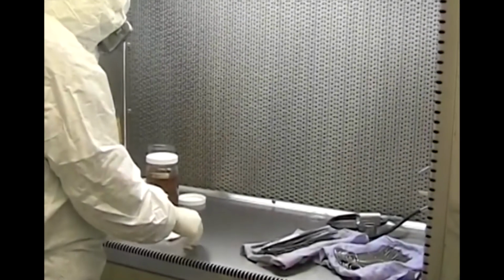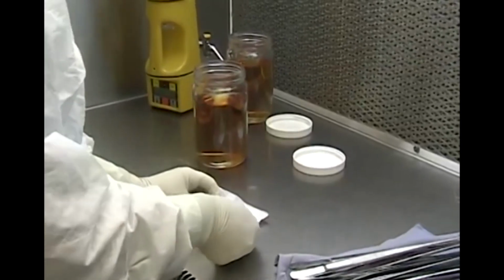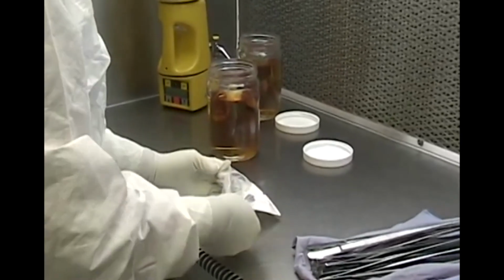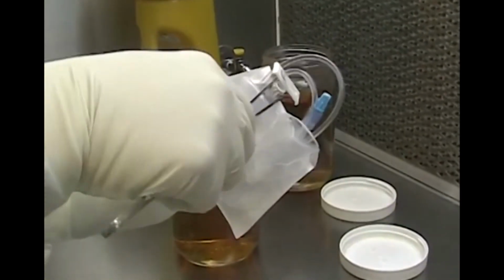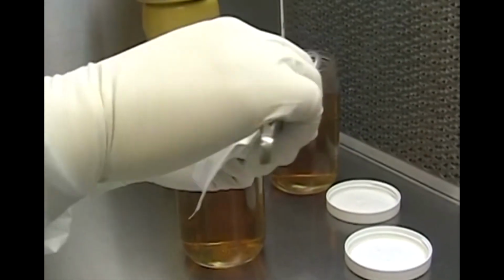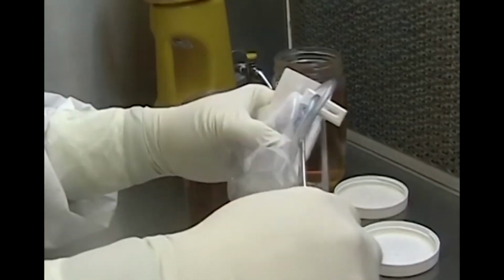Sterility samples may be tested by membrane filtration or direct transfer, depending on the type of sample that is submitted for testing. The sample packaging is opened in an ISO Class 5 hood. Samples may need to be manipulated in order to expose all surfaces to the test media. This manipulation may include cutting the sample and removing caps and plungers.